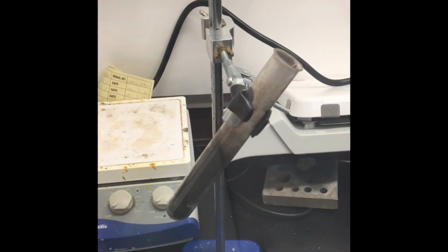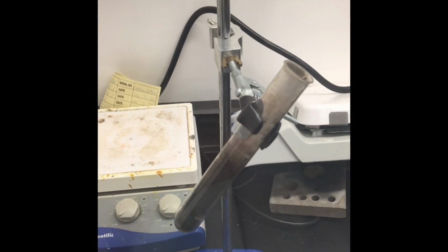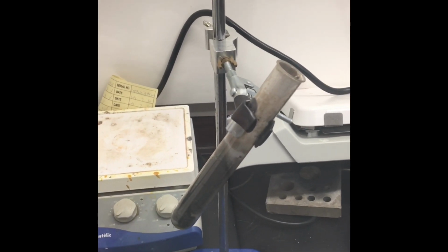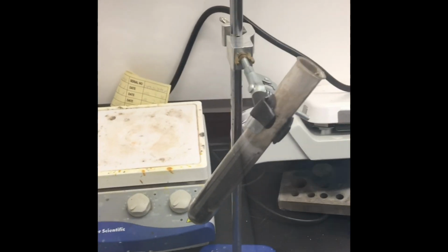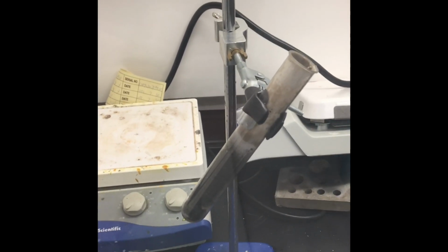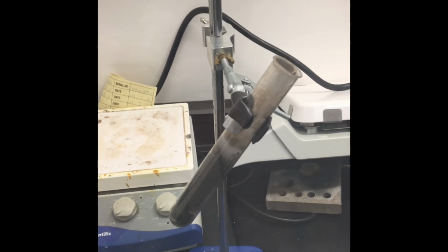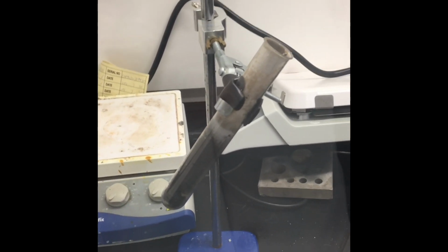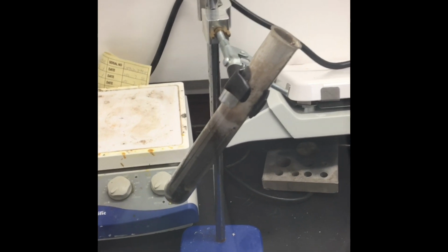Now what happens when you add oxygen to something that has carbon and hydrogen, and even oxygen, like the gummy bear? This is exactly what happens. So we went from an endothermic reaction to an exothermic one, something that generated a lot of energy, and that's what we saw when it exploded.